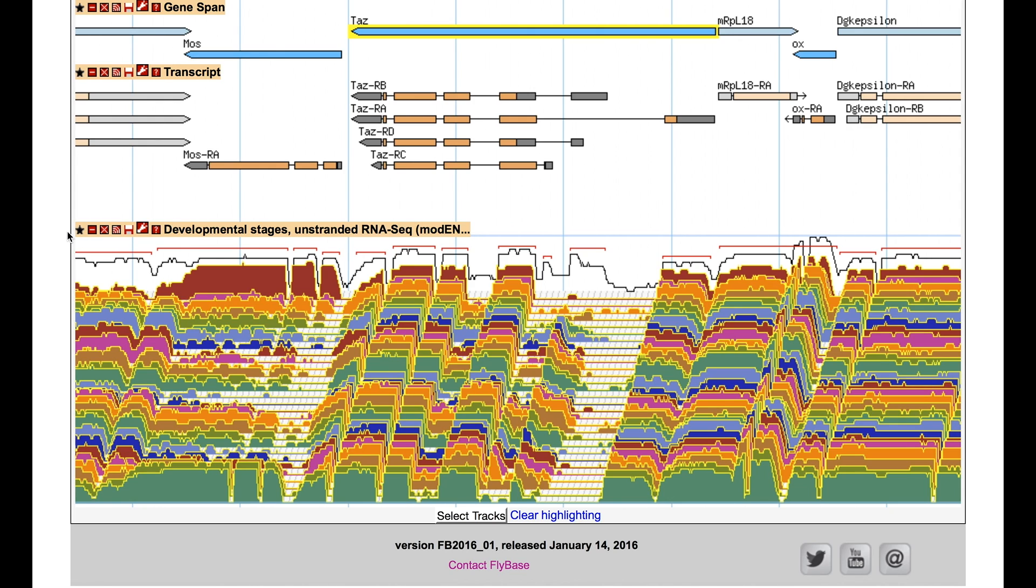Note that for the purpose of clarity, some default GBrowse tracks have been hidden.